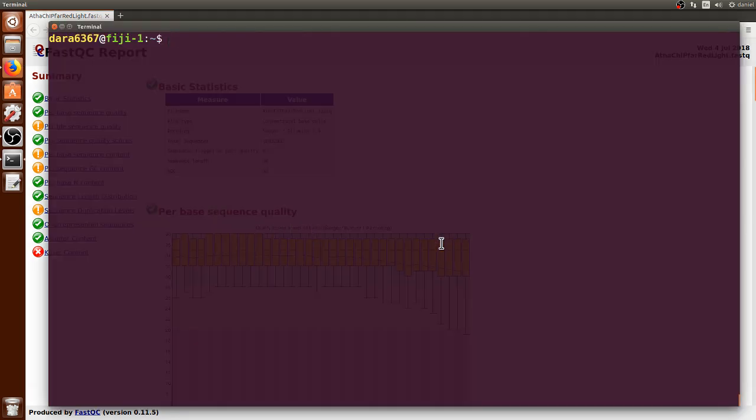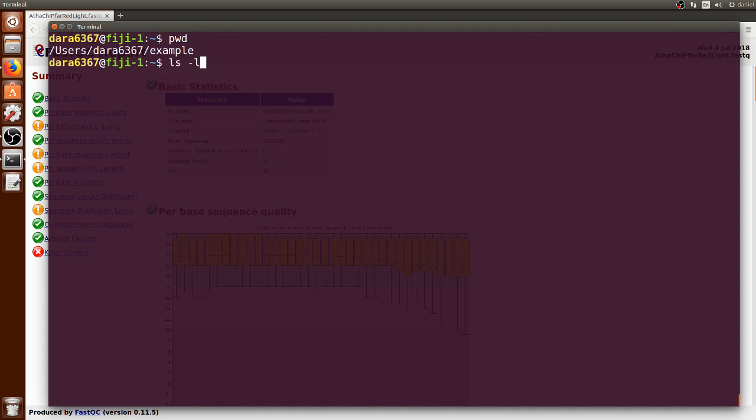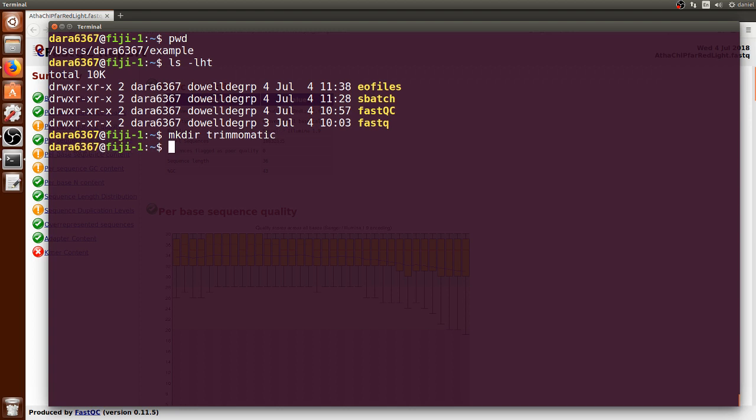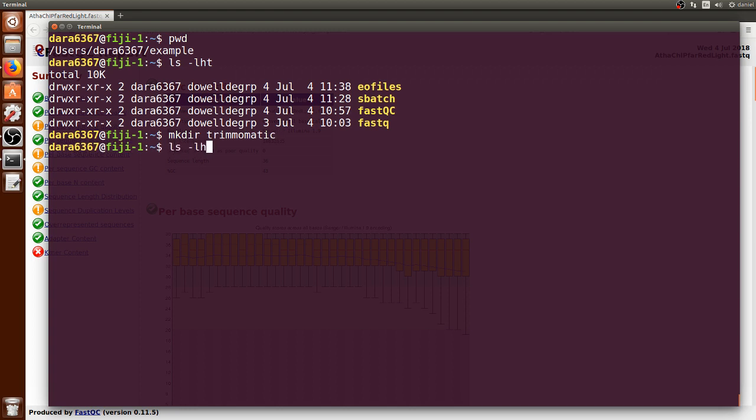We can go to the terminal and print the working directory. Let's go inside of it and make a new directory called Trimmomatic, which will contain the output files from Trimmomatic.